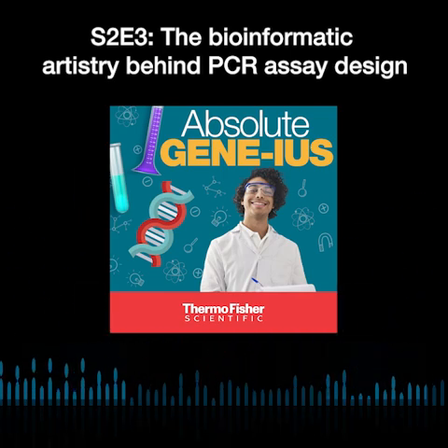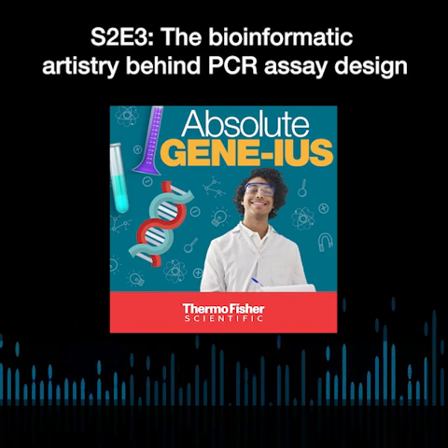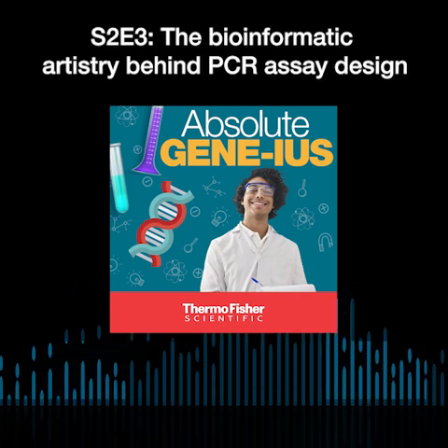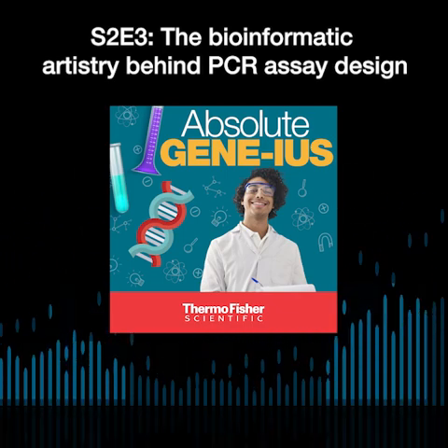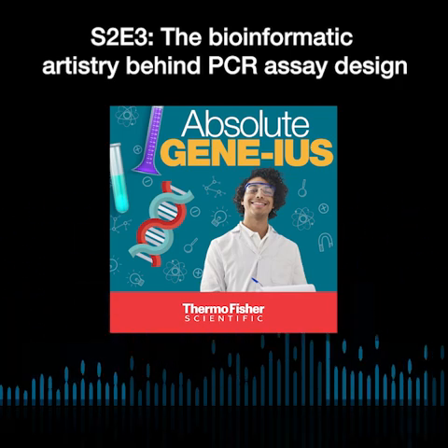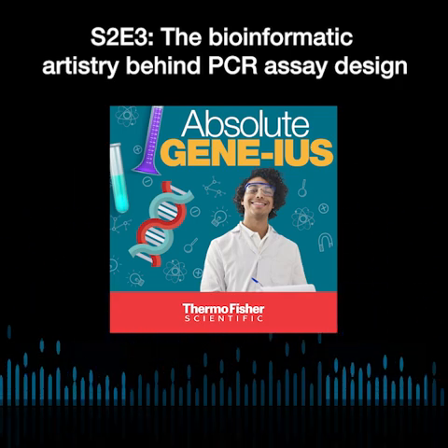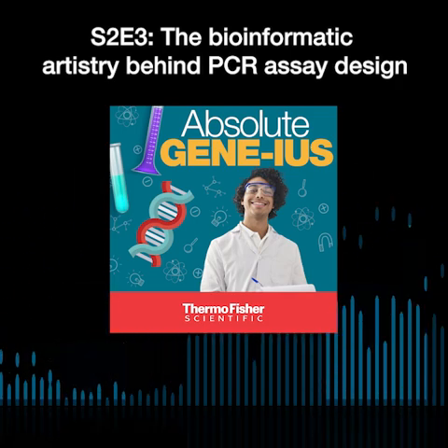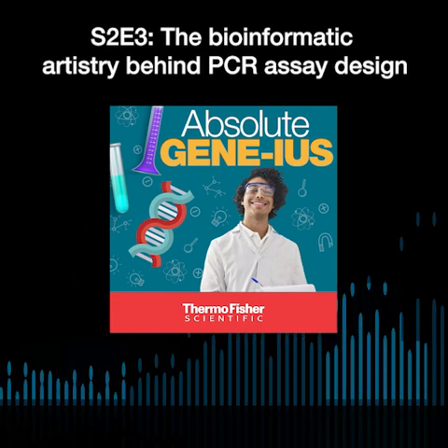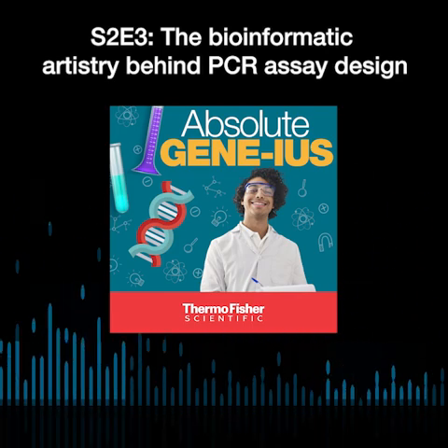And so you really need to account for a very large background community. When we were doing the testing, you could not really take the results from one test and just predict the results on the next one as well. So that needed a fair bit of optimization, and I'm glad that it works as well as it does now, but a lot of hard work went into it from the in silico side and from the testing side. Yeah, makes sense. Different amounts of, for lack of a better term, gunk in the sample.